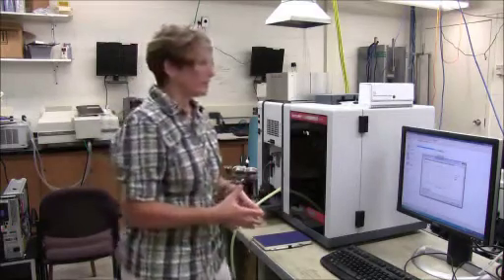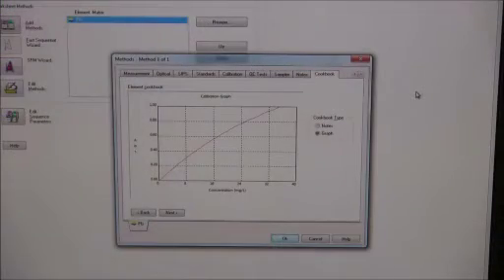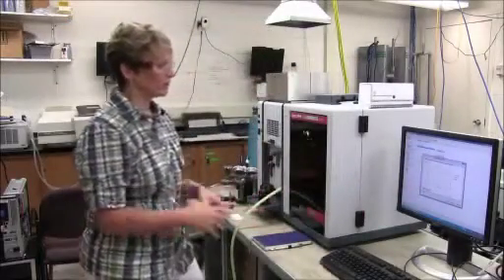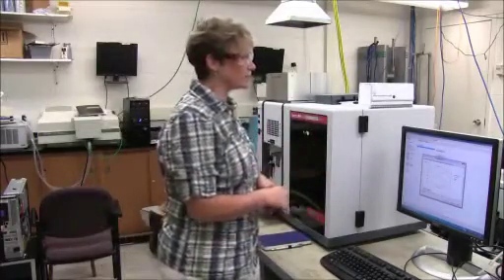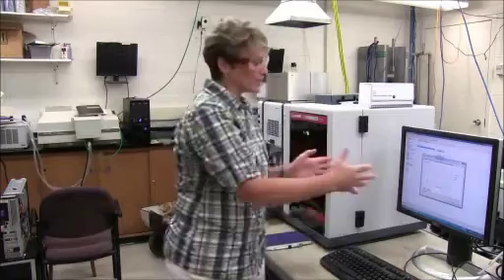So for example, here we have a graph that has a concentration in milligrams per liter, or ppm, and an absorbance range. And as I was mentioning earlier about our kind of cookbook recipes, most software that will come with your atomic absorption spectrophotometer will have something like this to show you the range that you will need to make your standards in.